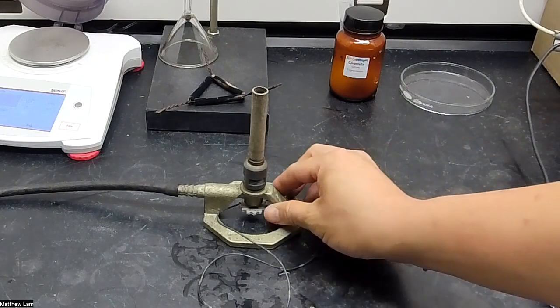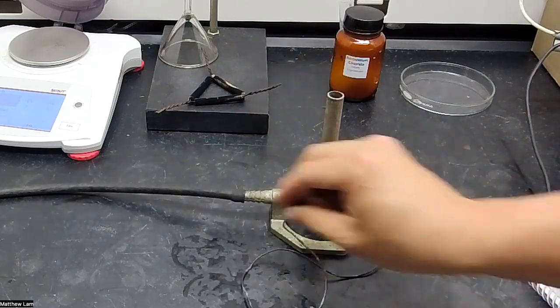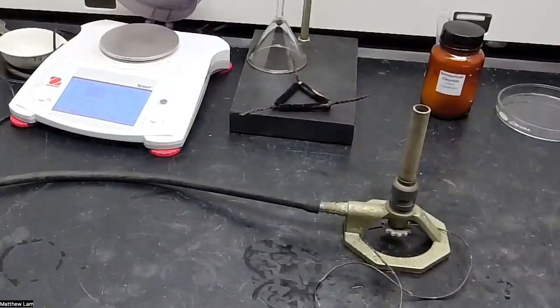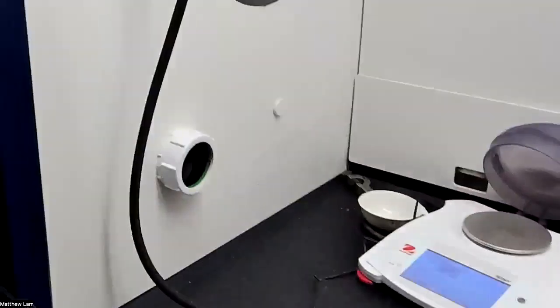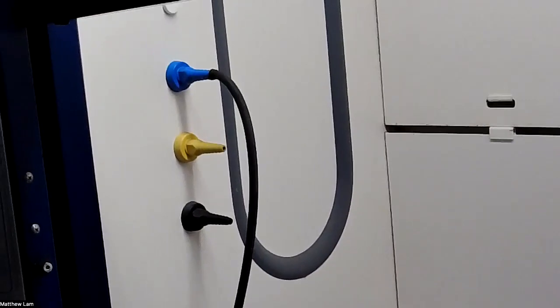So this is the Bunsen burner here. This Bunsen burner, as you can see, is connected to - let me open this hood a little bit - a gas line up there.